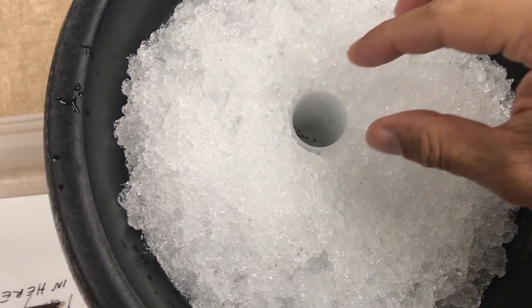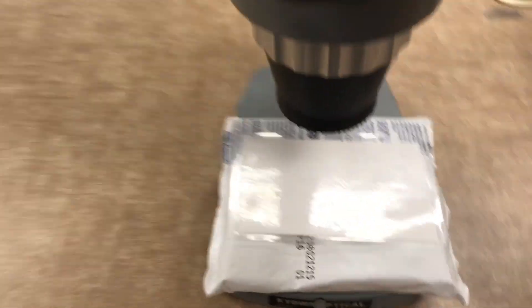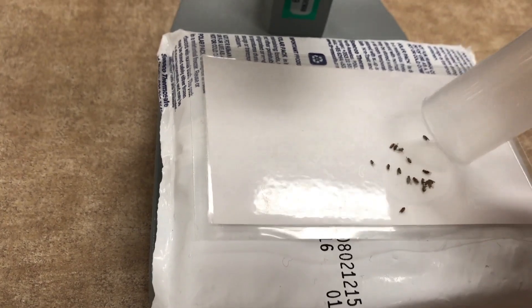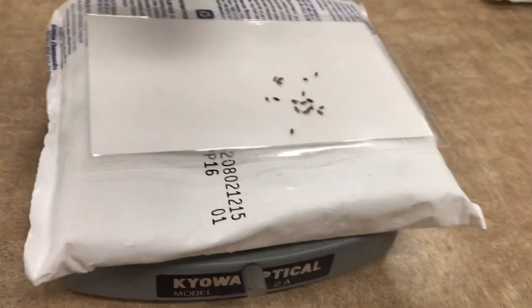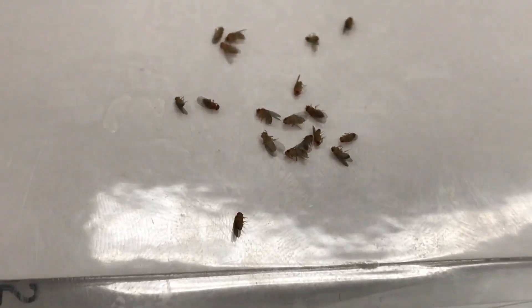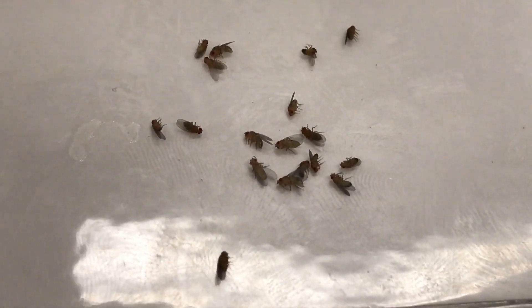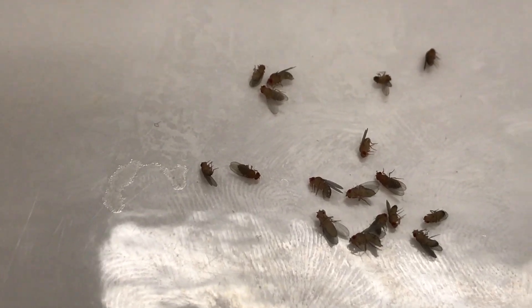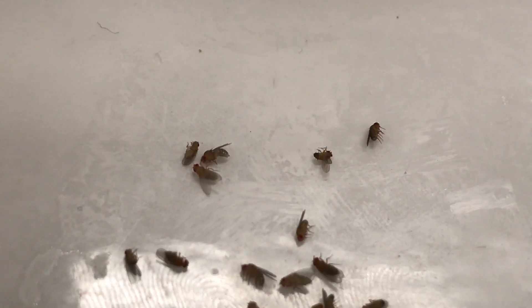Next step: take your flies — they are sleeping — and put them on top of the card. Now you can count and score your flies. You can see males from females. That one is a female and probably those little guys are males.